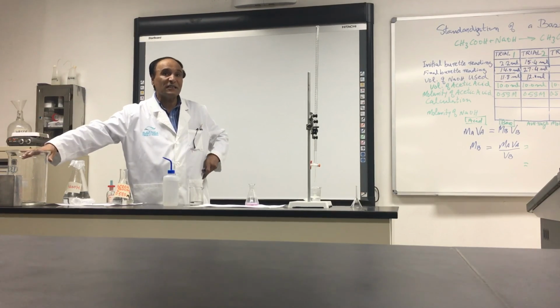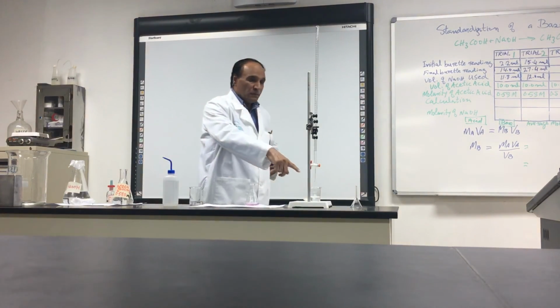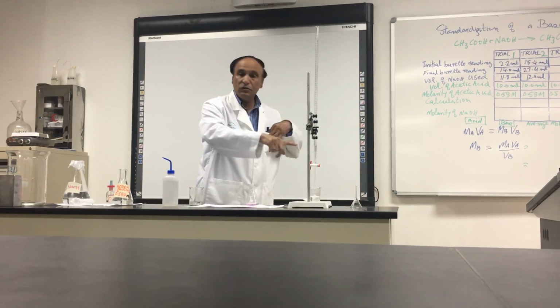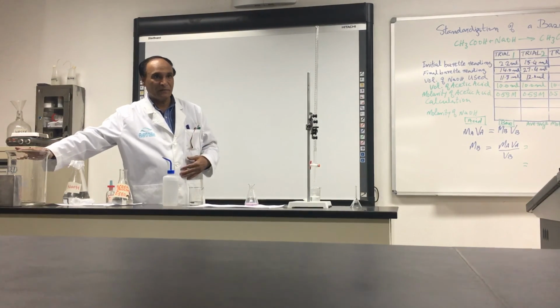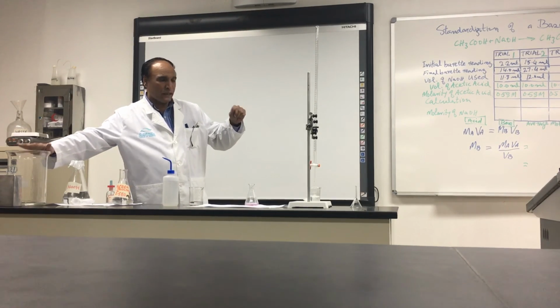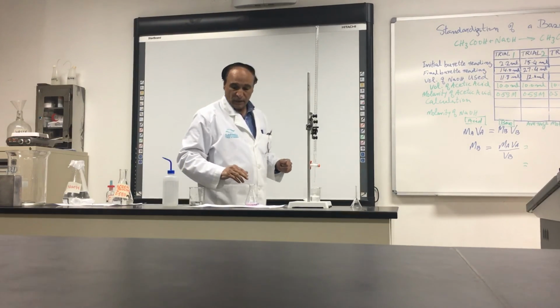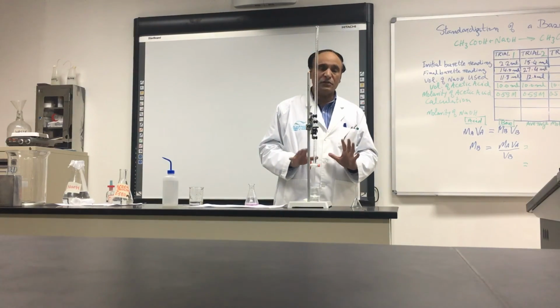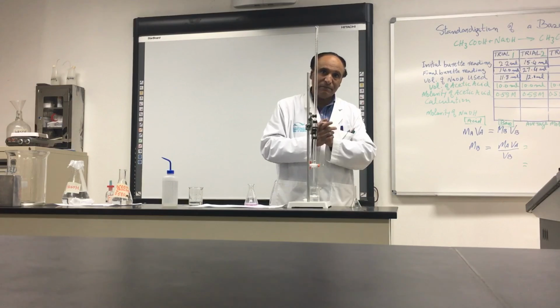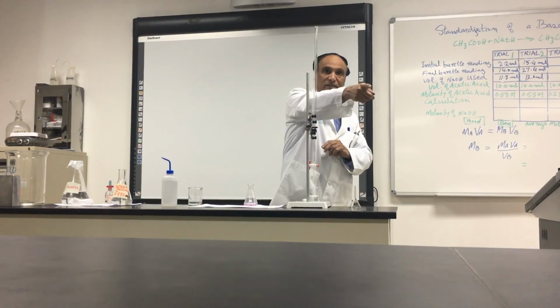When you finish the experiment, the remaining sodium hydroxide, not this one, only the sodium hydroxide, you return back into this one. Did you understand what I am saying? Yes. I will tell you how to do the calculation. So those things which you have used, you must wash them before you go home like this.